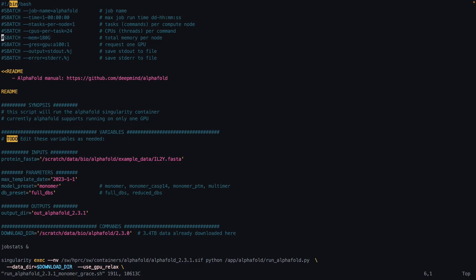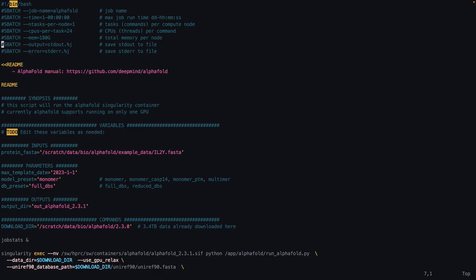Right? There's a couple of things. So first, I'm going to show you the steps I take to remove the GPU settings that are inherently built into this job script so that it only runs on the CPU nodes. The first thing we need to do is remove this sbatch command. This is one of our directives that lets the Slurm scheduler know that we're requesting a GPU and specifically requesting the A100 GPUs. Right? So in Vim, without editing, if you just press the letter D twice, that'll delete whatever line your cursor's on, right? So pretty simple.